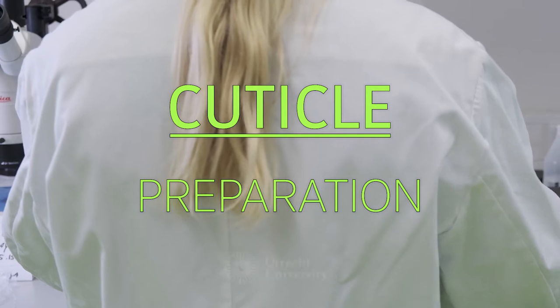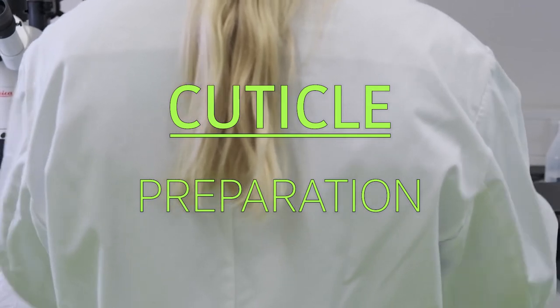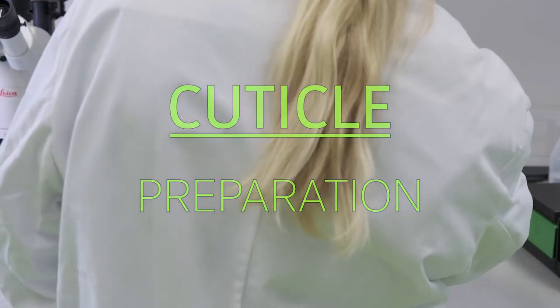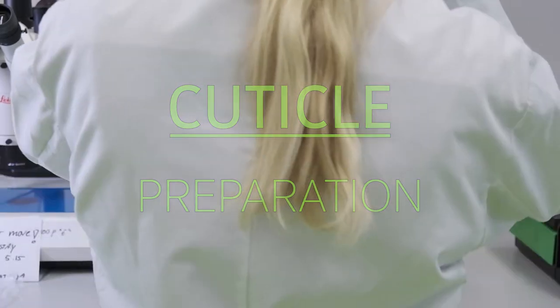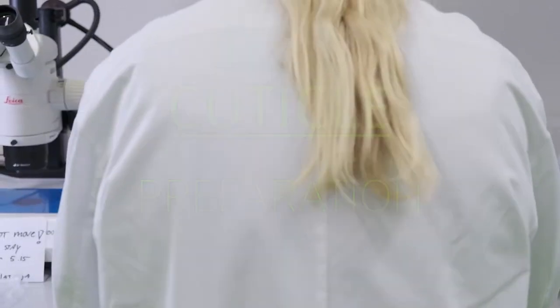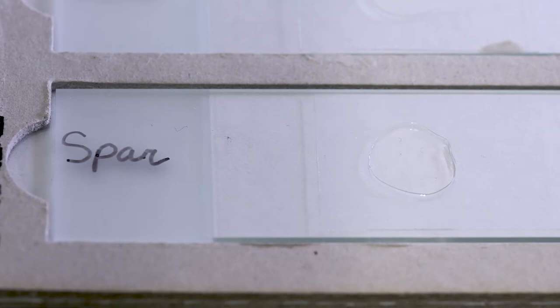A cuticle is the outer layer of a leaf and it has an imprint of the leaf epidermal cells, the stomata also, and that forms a snapshot from the moment that plant lived.